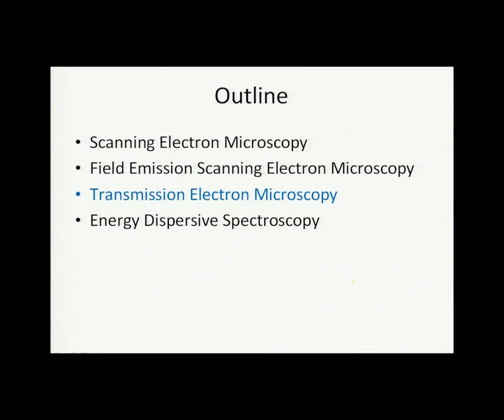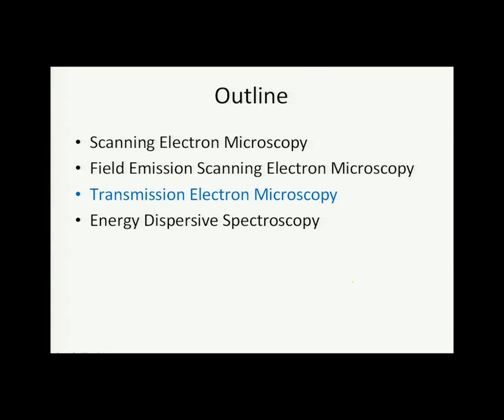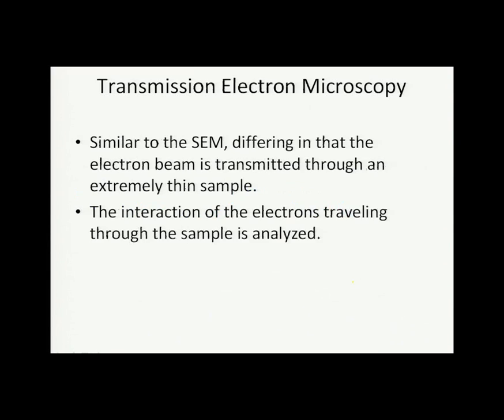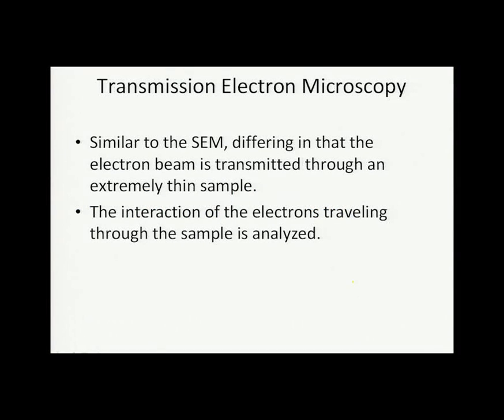Up next, we're going to discuss transmission electron microscopy. So we've already gone through SEM and then FESEM. Now we'll discuss TEM, transmission electron microscopy. This is similar to SEM, but it differs because the electron beam is transmitted through the sample.